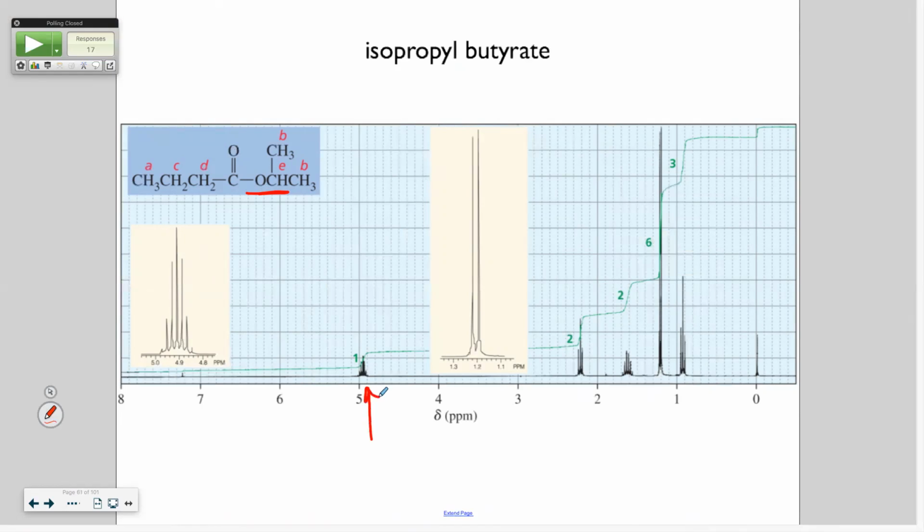It gets even smaller when you put it on a piece of paper than on the screen. All right, and look here. 1, 2, 3, 4, 5, 6, 7. They're all there. We're not going to be sneaky and not give you blow-ups if they're available. We're going to give them to you. The only way to get good at looking at NMRs is to do what? Look at NMRs.